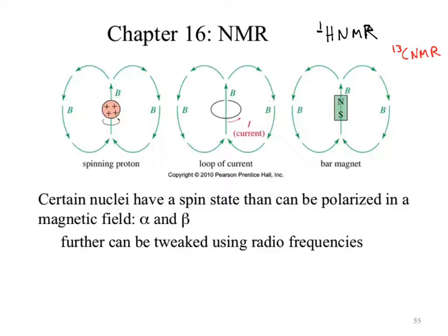Okay? What we can then do is say, well, what else is around that magnet? Let's say I take my magnet and I put a lead blanket around it. Would I be able to detect the magneticness? No. That's probably not true, but you get where I'm going, right? We have a shield that protects it. Well, guess what electrons do? The exact same thing. The electrons around your atom will shield that nucleus from the effects of the magnetic field.